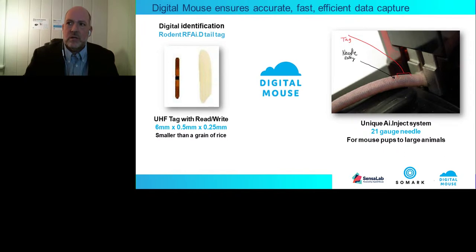So you may be using currently available RFID technology in your labs for animal identification, but these are not the same ultra-high frequency or RAIN compliant. For example, they would not integrate with a sample or personnel identification badges. Additionally, the current RFID tags are not purposely built or designed specifically for animals, which is an animal welfare concern.